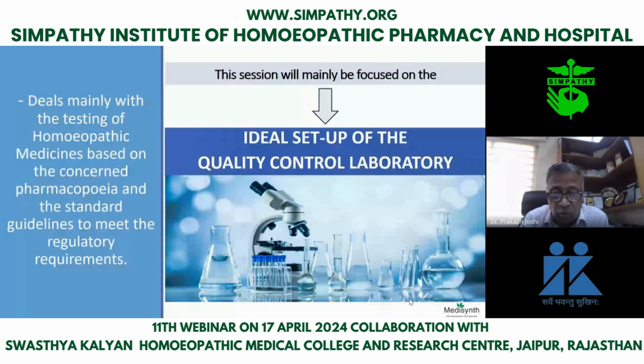Then if you do the microscopy, you should have the acicular grains. Then you have compound starch grains. So like that, these are the methods, and the ideal laboratory is the one which has the facility to test all the parameters which are mentioned in the pharmacopoeia.